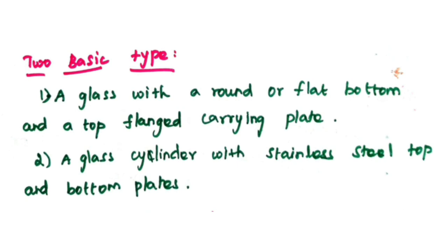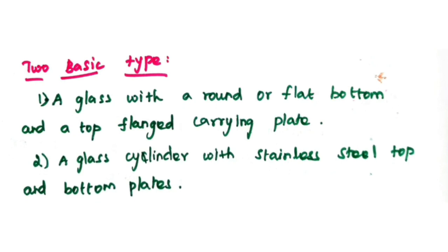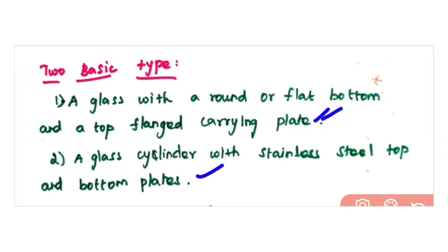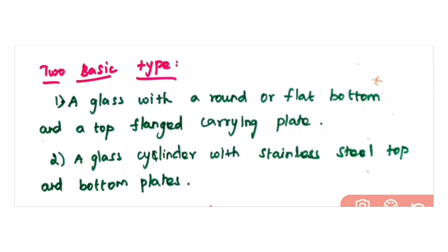Autoclave is a steam sterilizer. Autoclave is a machine that uses steam under pressure to kill harmful bacteria, virus, fungi and spores on items that are placed inside the pressure vessel, that is your autoclave. So you have to keep the object or your vessel inside the autoclave machine for the sterilization process. And in the second model you can sterilize in situ, but 30 centimeter diameter is the upper size limit to withstand the working pressure. Okay, then when you consider the cost of the fermenter, the second type, that is vessel with the two stainless steel plates, costs approximately 50% more than that with just one plate.